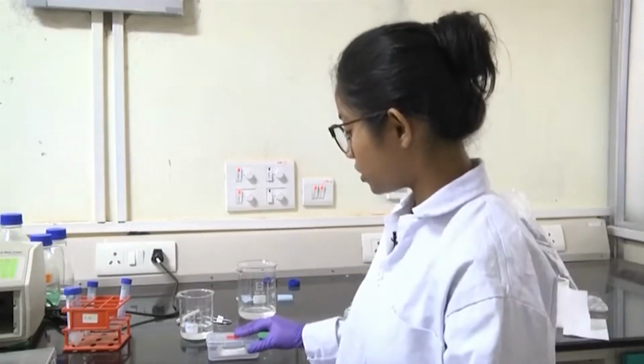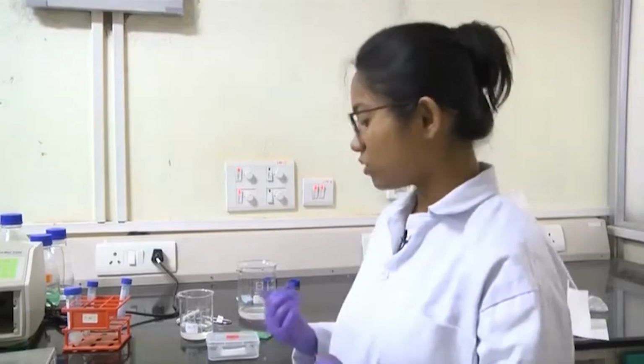hours, and then we will wash the secondary antibody away from the membrane, and we will put the substrate for the enzyme. In our case the substrate is luminol and peroxide, hydrogen peroxide. Those two we have already purchased, and we will mix those two substrates in equimolar concentration, and put almost around 100 to 500 microliter on top of the membrane and wait for 5 minutes. Then we will take the membrane and put it in the chemidoc machine, and we will be able to see if any band is present or not.